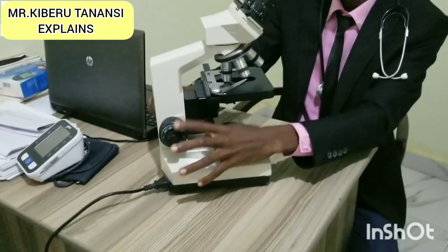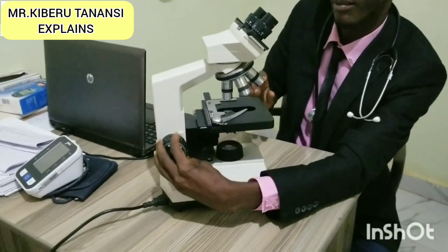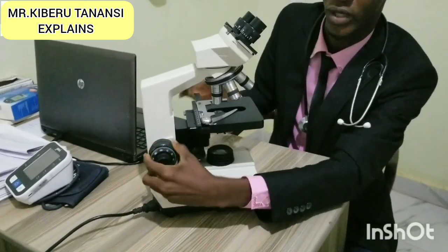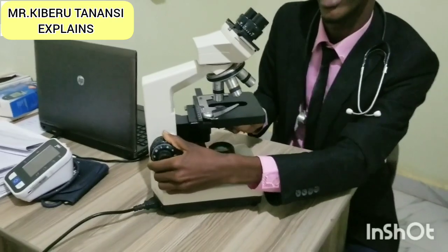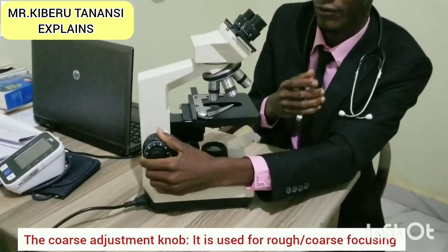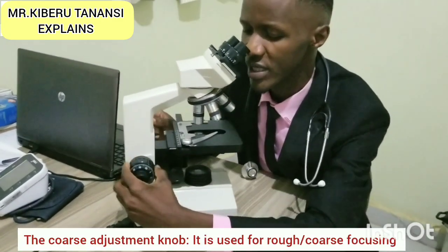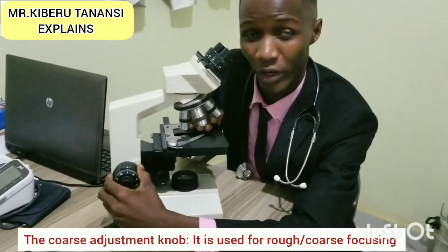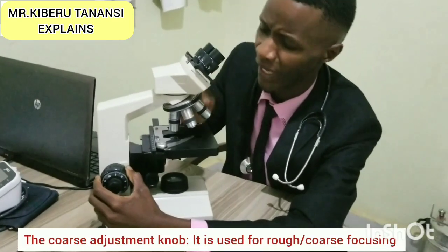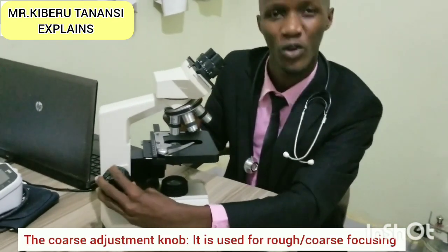When you rotate this big part, the stage moves up and down, up and down. So this big thing I'm holding is the coarse adjustment knob. Its function is for coarse focusing. Coarse focusing means that if I put the specimen here, I will rotate the coarse adjustment knob up to when I am able to see that object. So this is the coarse adjustment knob for coarse focusing.